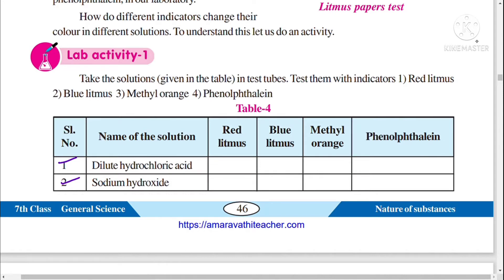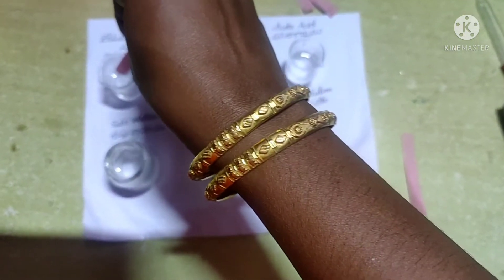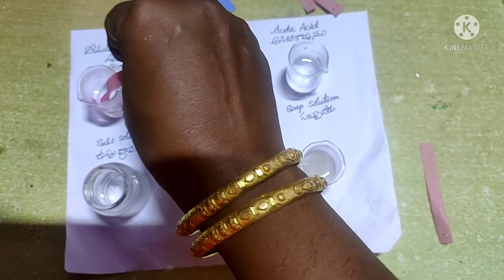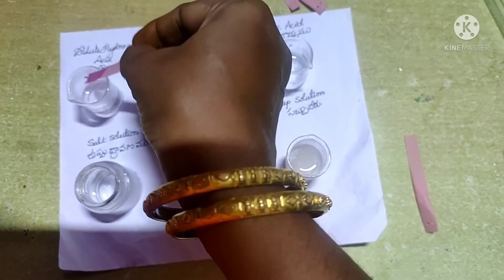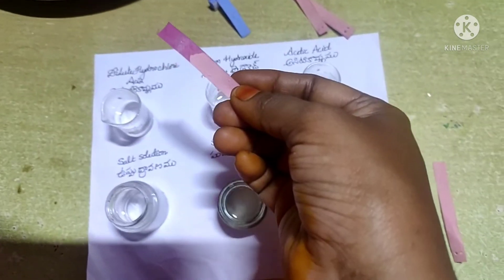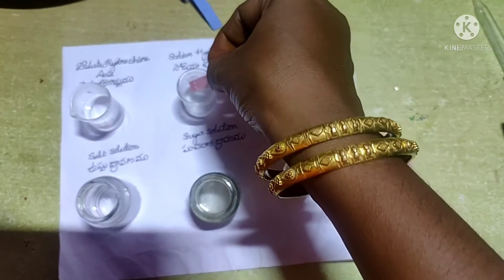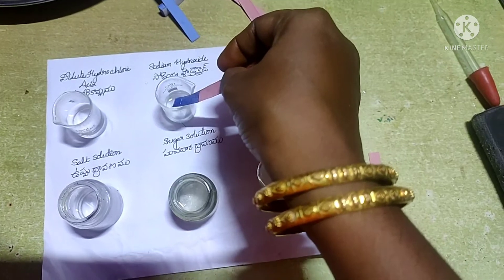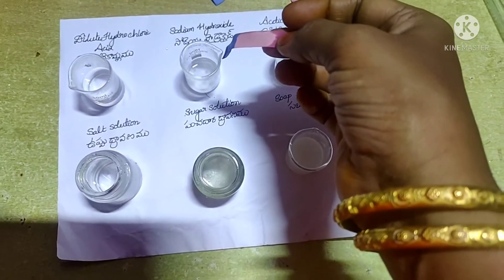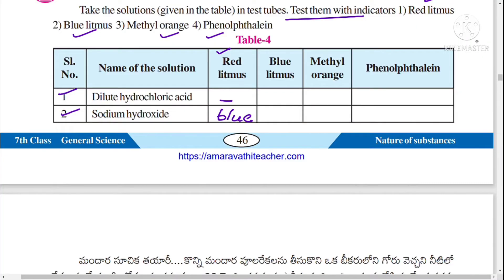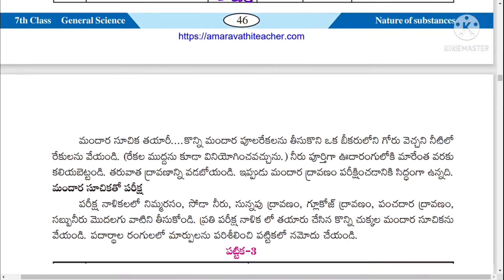We will test these solutions with the indicators. We have four indicators: red litmus, blue litmus, methyl orange, and phenolphthalein. First, take a red litmus paper and dip it in dilute hydrochloric acid — there is no change. Then take red litmus paper and dip it in sodium hydroxide solution; it turns blue, indicating that the given solution is a base.